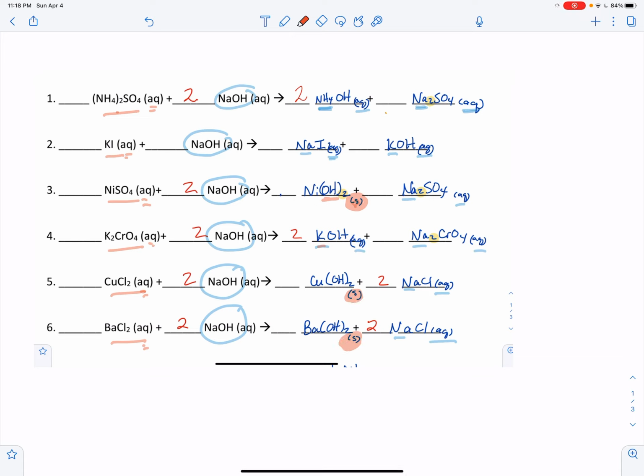So we are going to do a reaction where first we dissolve each of these in water, and then we add some drops of NaOH to each of them, and they'll form these 2 complexes. You can see that there are only 3 cases where you'll make a solid. We're going to look at them after the reactions, and for the 3 that make a solid, we're going to do other reactions to try to identify them.